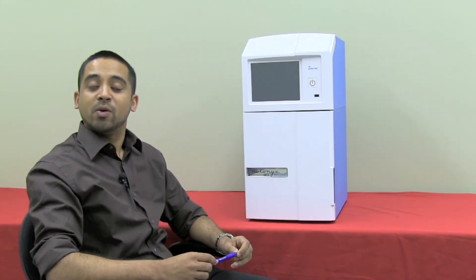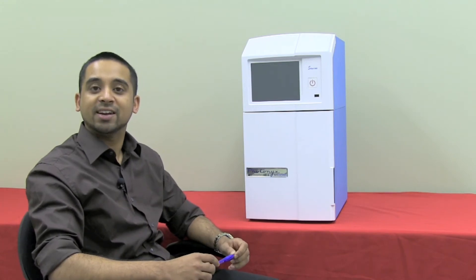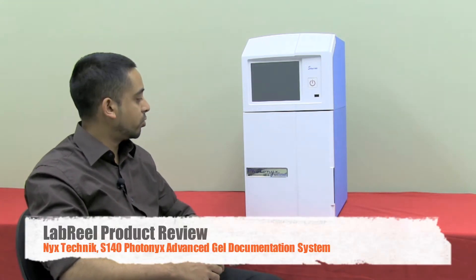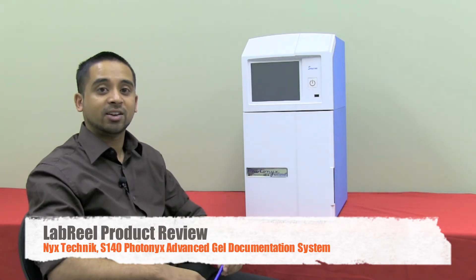Hi guys, Jamal again. Welcome to another review from Labreel. Today we're going to be looking at the Nyx Technik S140 Photonyx Gel Documentation System. So let's start by turning the instrument on.